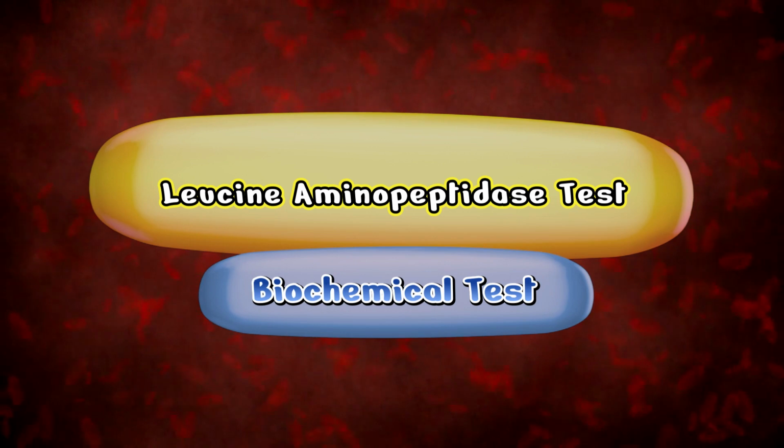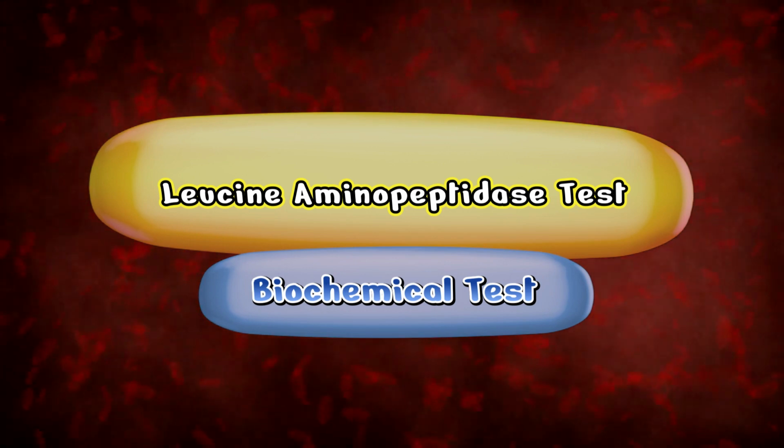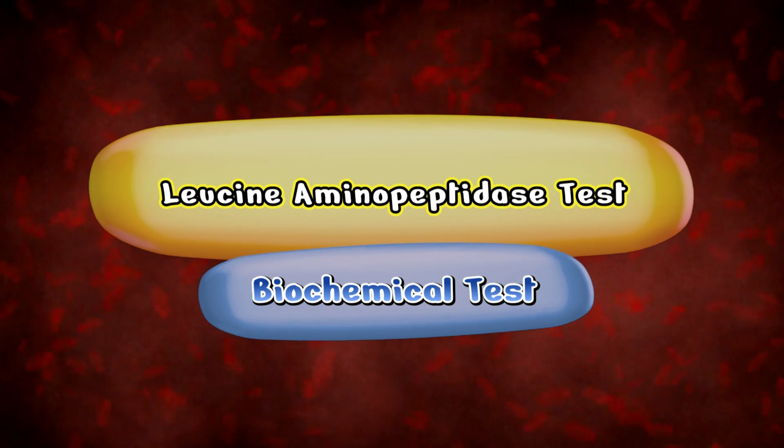Microbiology topic on biochemical test, Leucine Aminopeptidase test.